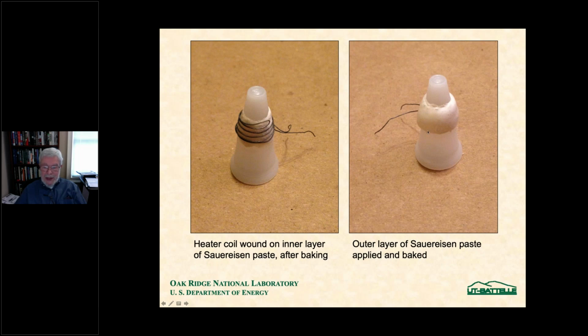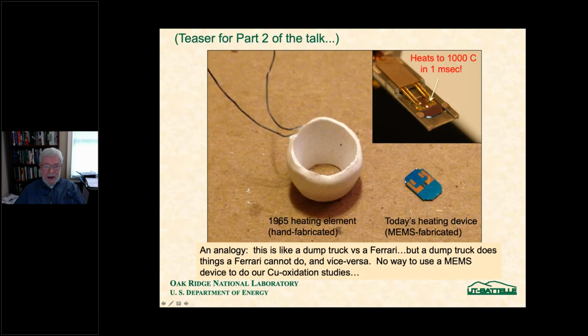And after a couple of days with baking and all, we had a furnace. This took a while to develop and actually make work, and it actually worked. It could heat the whole cartridge up in the microscope to a calibrated temperature of 525 degrees.